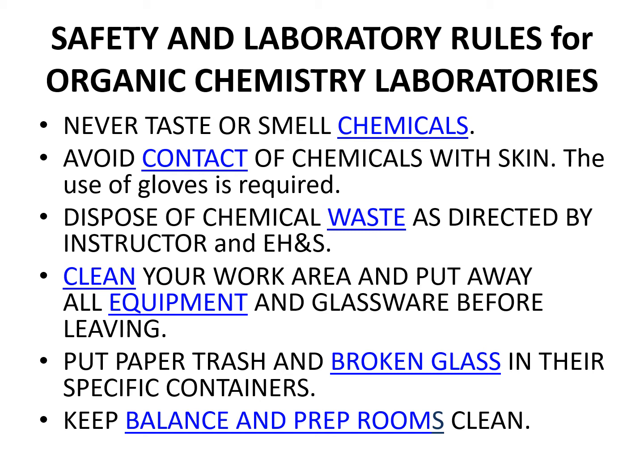And then once you're done, your entire area has to be cleaned and wiped down. All equipment and glassware has to be cleaned and dried and put away back where you got it. Normally when you're in the lab, you're not allowed to leave until you check off with your TA and that's all done. So we make sure pretty well that you're keeping on track with that.